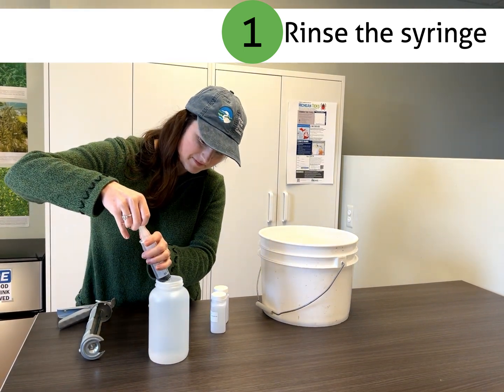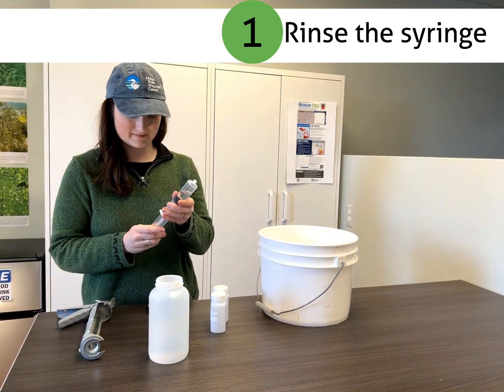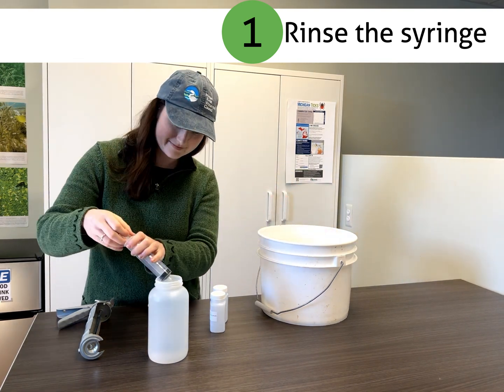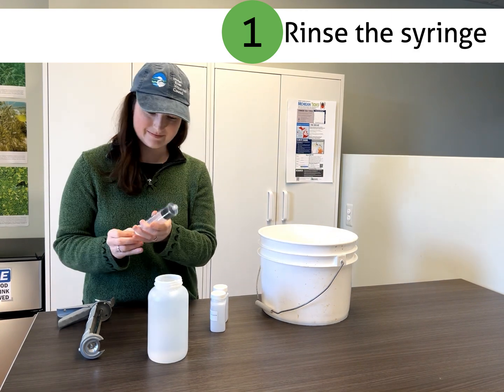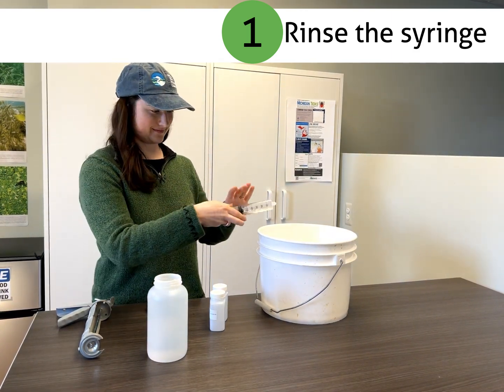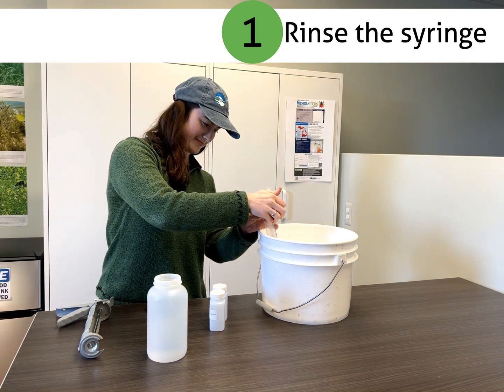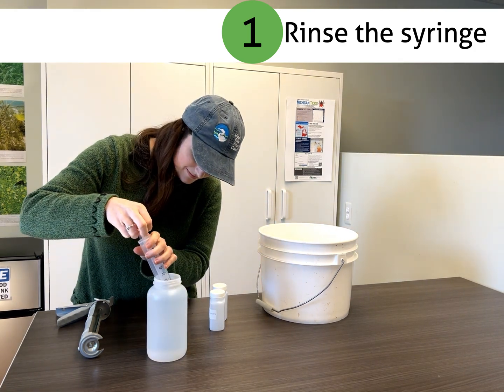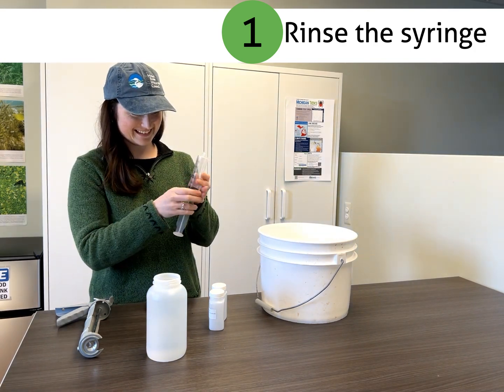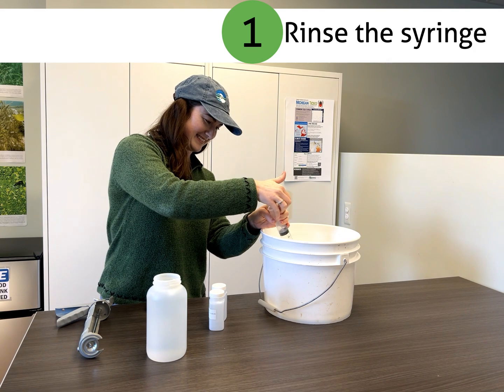First, we want to rinse our syringe with sample water. You can either use the water from the 1 liter bottle that you collected, or if you're in stream, pulling water directly from the stream. Pull at least 5 ml of water into the syringe and swirl it around to clean the inside, then expel the water either on the ground, to the side, or downstream.